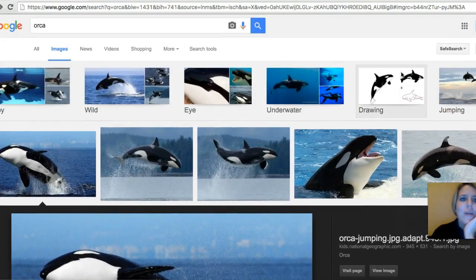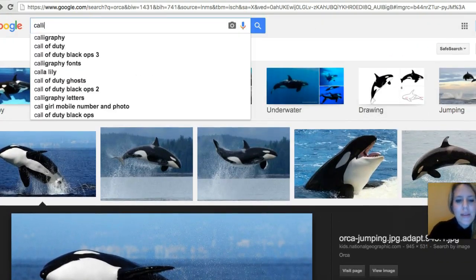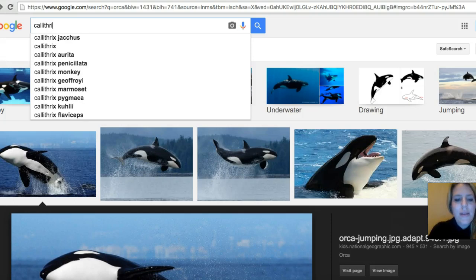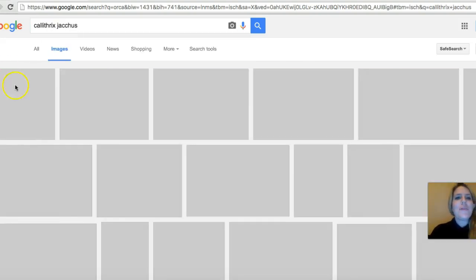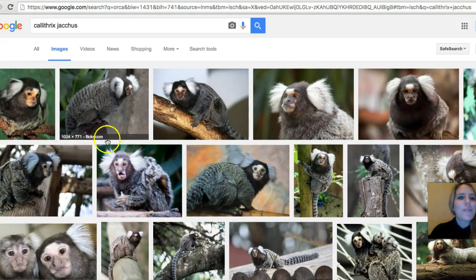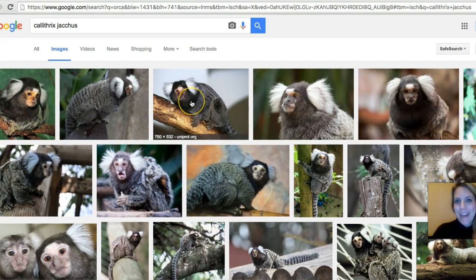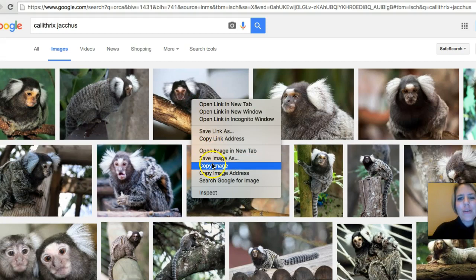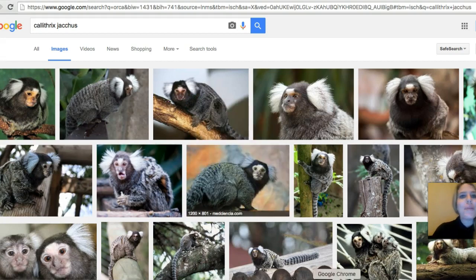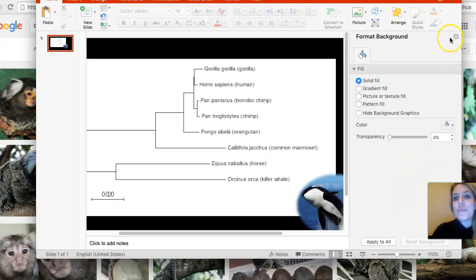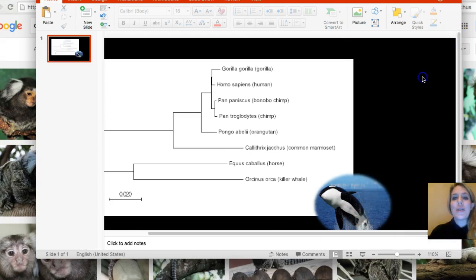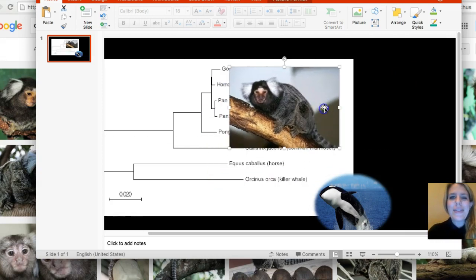So I had one called Callithrix jacchus. I'm going to find a picture of a Callithrix jacchus. Look how cute he is. I'm just going to double click on him. You can actually copy the image, you don't have to save it. If you copied it, then you can just go on here and paste.